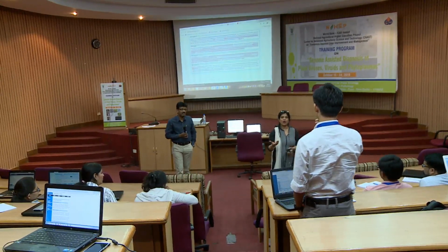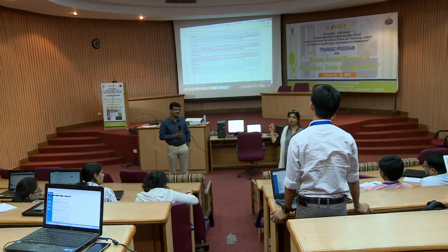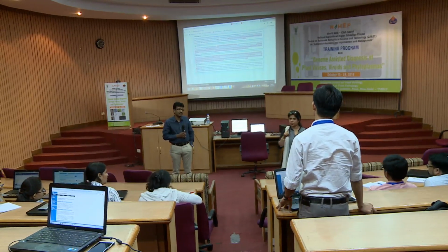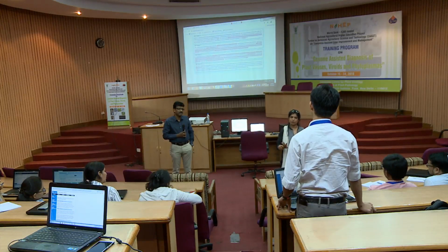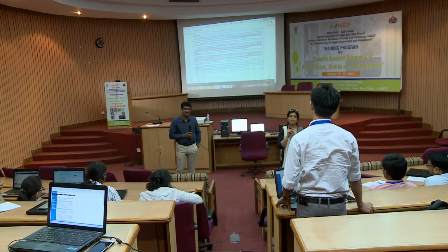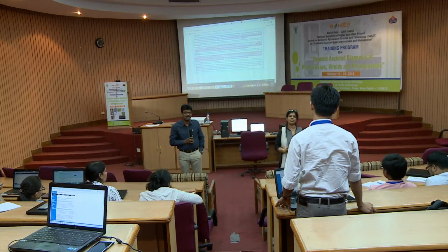So how honest you are in curating the sequence matters. That's the reason earlier they were not asking for annotation and curation, right? Earlier, whosoever wanted could submit the sequence like that only. But now, until and unless they verify the annotation and the CDS, they don't consider it. That is one of the reasons they want the quality check. Whosoever now cannot send the sequence as such.